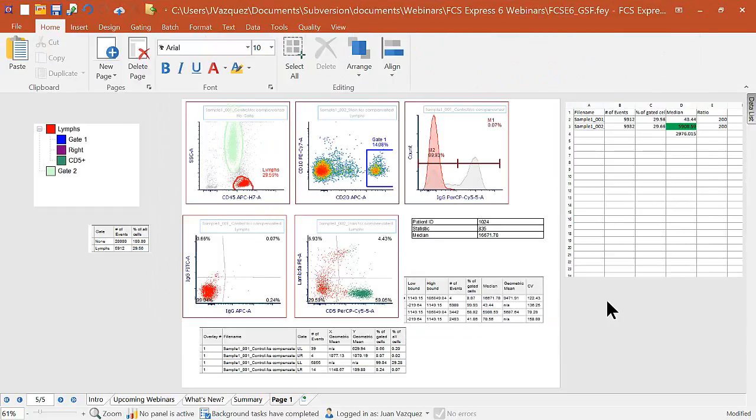What I can also do is export my data to PowerPoint, or export to PDF, or export different images. And I can incorporate all of that as part of my batch processing capabilities. So once I'm actually done, chances are I probably want to take this data and export it all at once and have the software do that for me automatically.